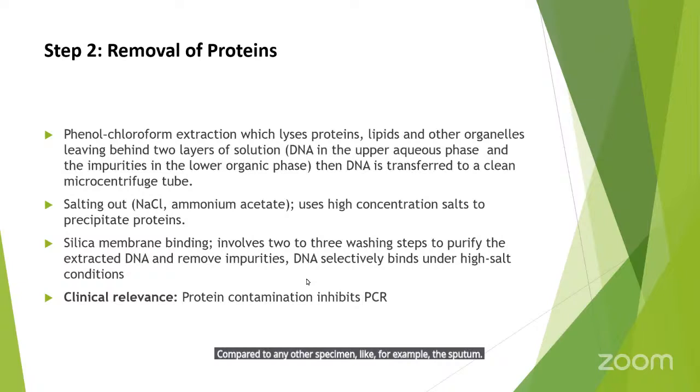If we were running, for example, a Mycobacterium tuberculosis PCR, in this case, remember in most cases these MTB bacteria are normally there are areas known where we can actually use the biopsy. For example, okay, let me come again.